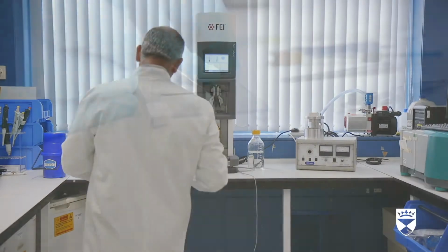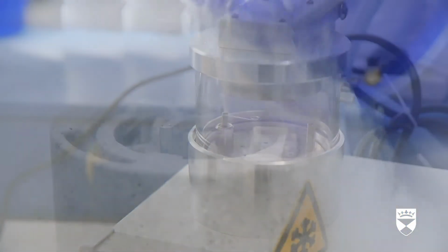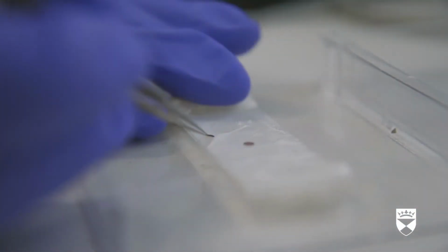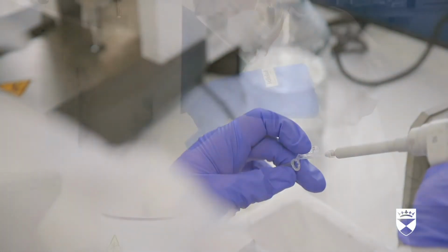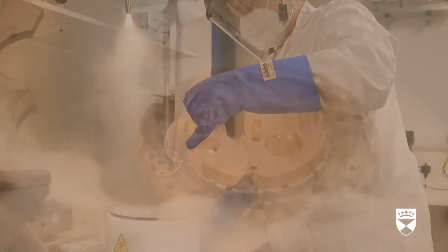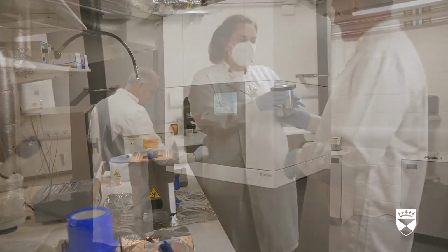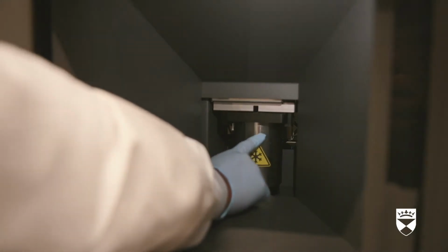To view proteins in the electron microscope, we first need to prepare a sample. We break open cells and take out the proteins we are interested in studying. We put them in a liquid called a solution, which is added onto a small mesh grid. The proteins in the solution stick to the mesh and are frozen rapidly. We then take the frozen grid to the electron microscope and place the grid inside.